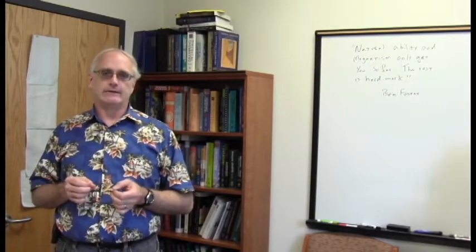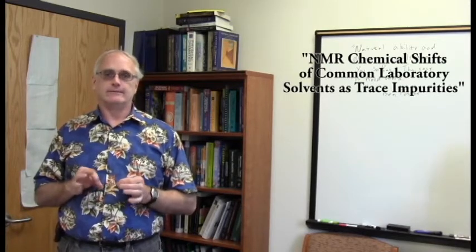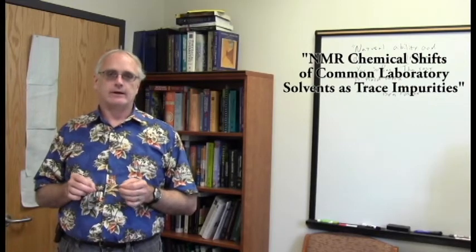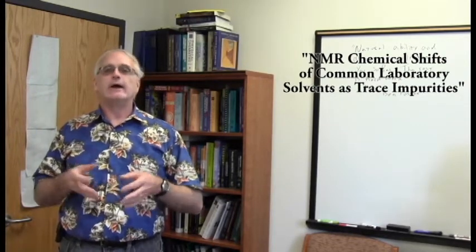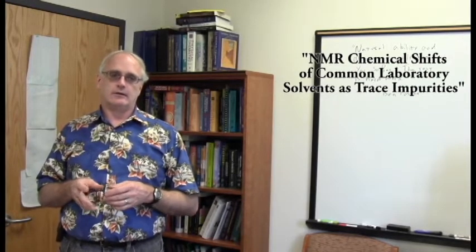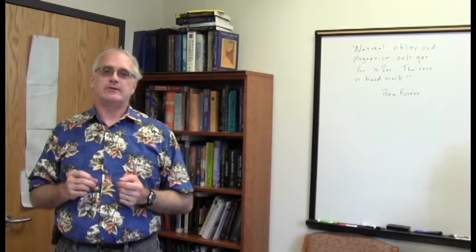What it was is a compilation of all the different positions that various molecules like water could have in all the different NMR solvents, all common contaminants that are in there. And as such, it's a highly useful paper and very much referenced. I reference it many times, and I even have a copy of it on the course website for your use as well.